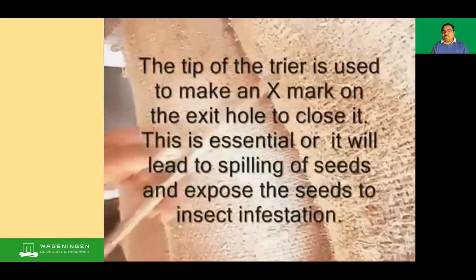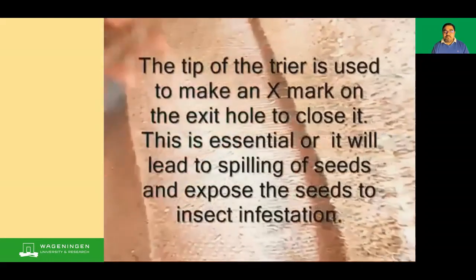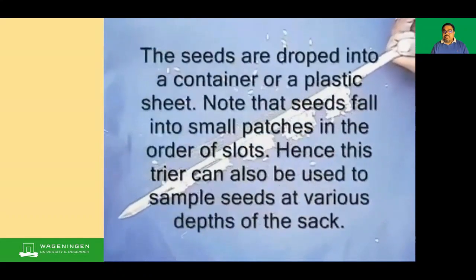Then you close the bag so that no more seeds are coming out of it. And then you take out the sample and then collect it.